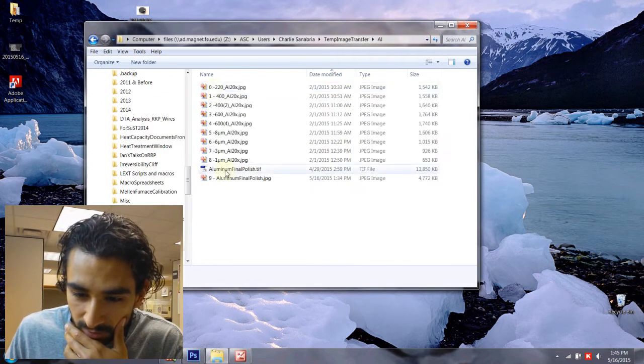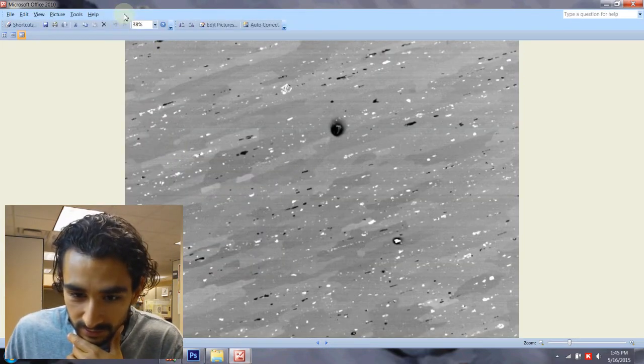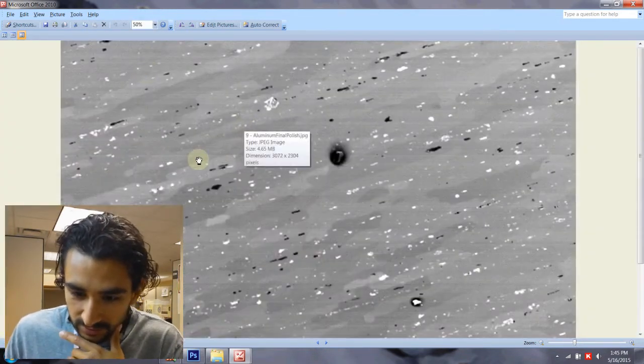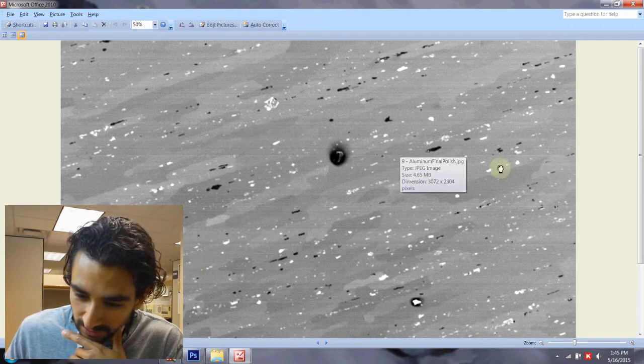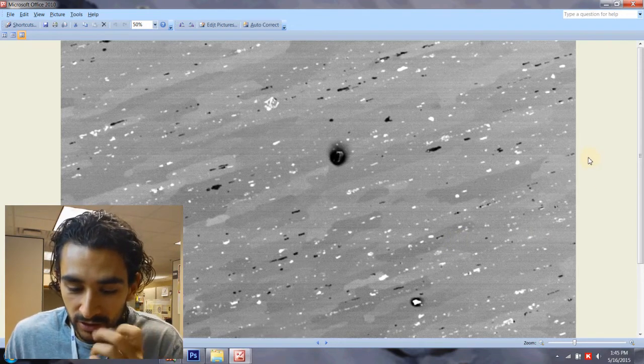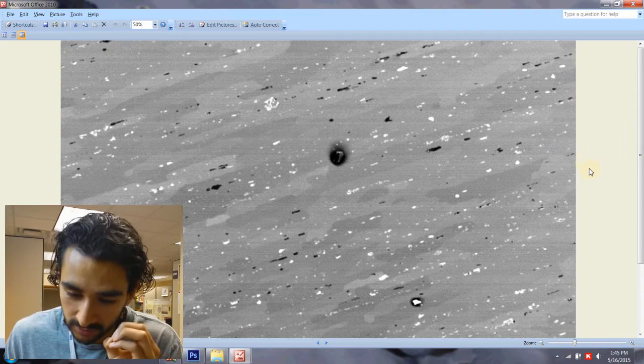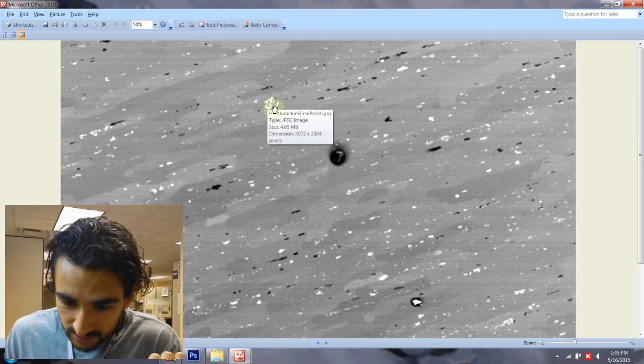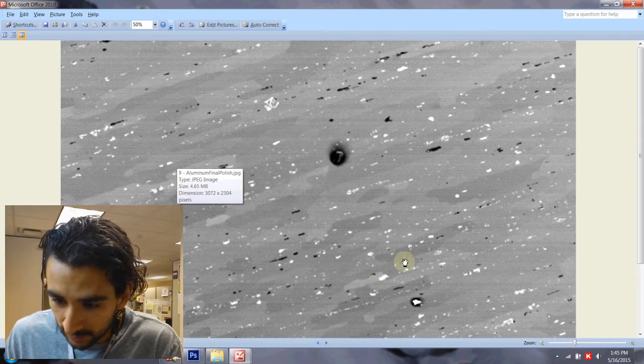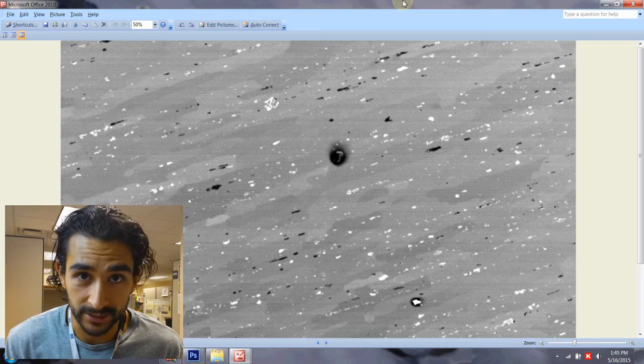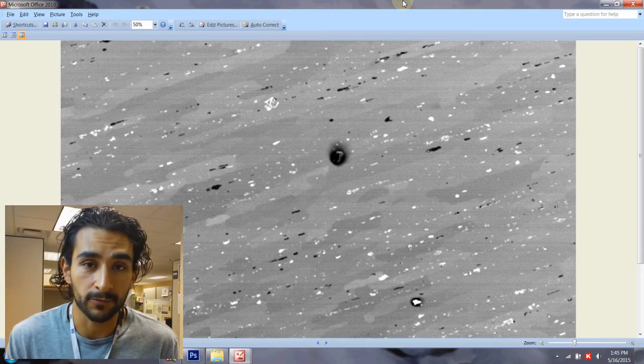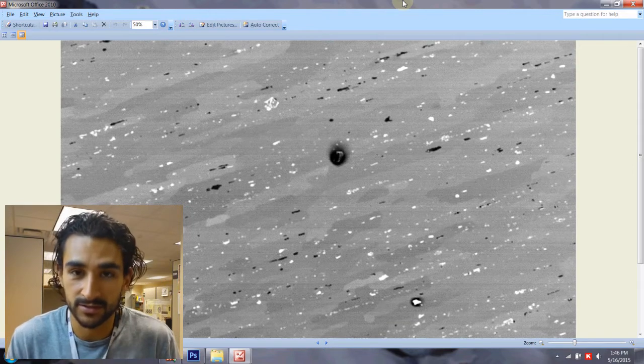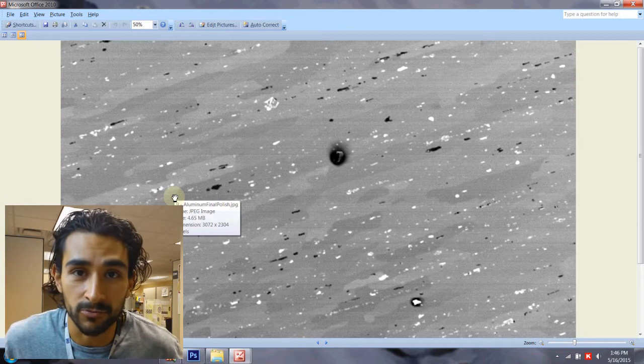Now for the aluminum block, this is interesting. Let me show you. You can see that the grains of the aluminum are somewhat textured. And let me zoom out maybe. And you can see they're going, all the grains are going in this direction. This suggests that whatever piece I took from a shop was probably drawn or somehow cold-worked so that the grains are all aligned in one direction. But this is what it looks like. This probably is stain. All these particles are probably precipitates. Then again, this is an example where I did not know what was in my sample. Therefore, any of these things, I don't know if they were there before or I introduced them while polishing.